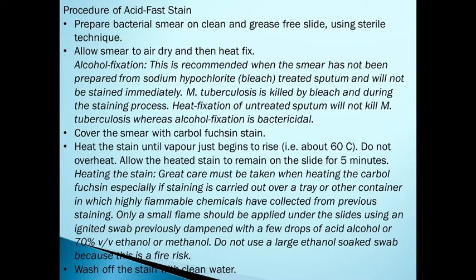First of all, prepare the smear on a clean and grease-free slide. As I told you, allow the smear to air dry and heat fix. Then apply the alcohol fixation. Sometimes, instead of heat fixation, we can even use chemical agents as fixative agents.